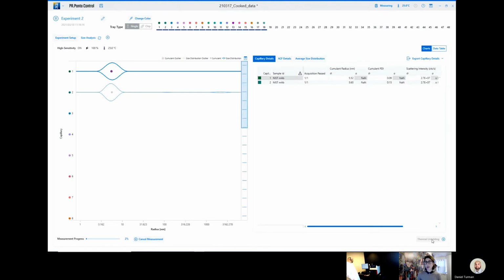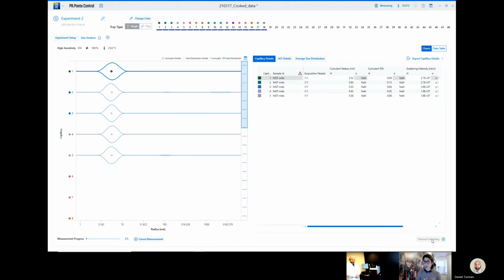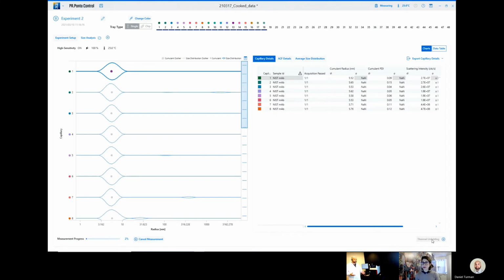Gotcha. And I know we're getting ahead of ourselves a little, but while this runs, when you do the thermal unfolding measurements, those nano-DSF, turbidity, and DLS are all acquired simultaneously at the same time. It's not first nano-DSF, turbidity, and then DLS? So they're acquired simultaneously, and the really nice thing is that's all attributed to the engineering of the instrument and how the optical device within the instrument interacts with the samples and takes the measurements.